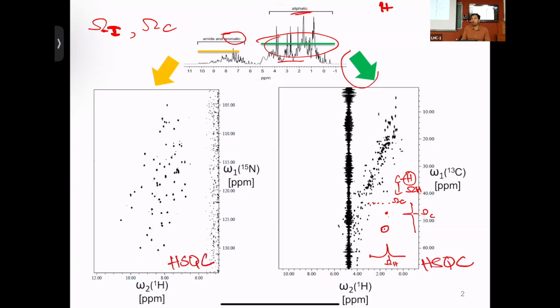What is HSQC? You all know what SQC is, single quantum coherence. H stands for heteronuclear single quantum coherence spectroscopy. So this 2-dimensional NMR experiment is like a fingerprint. I showed you an example of an organic chemistry paper where whenever they report a new molecule, they have to give the complete assignment of proton NMR, proton scalar couplings, carbon NMR. You go to supporting information, every paper has it. Similarly, for any protein that we study, this HSQC experiment is the molecular fingerprint.